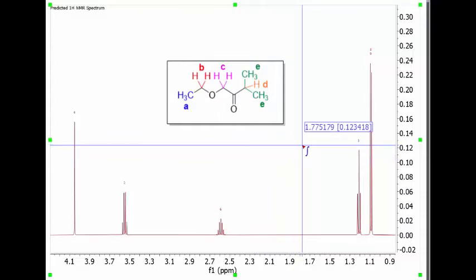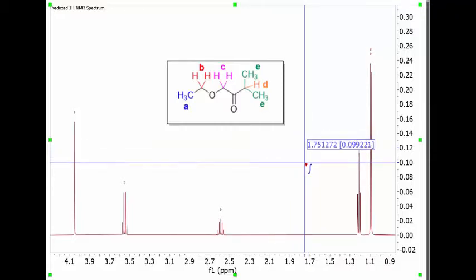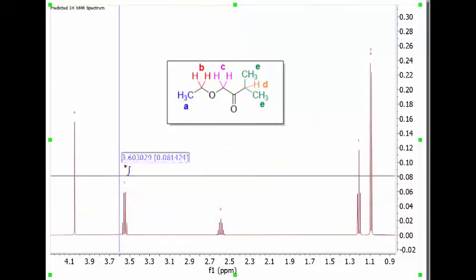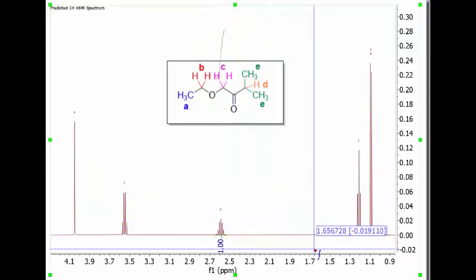So all I've done so far is paste the image that we were just looking at into the actual predicted spectrum. I don't have a sample of this on hand to take an NMR of, but MNova has a powerful prediction engine, so that's what you're looking at here. So now let me go ahead and integrate this, and if I just glance at these peaks, the peak that seems the smallest to me is this one, so I should probably integrate it first just to see if that ends up integrating for 1.